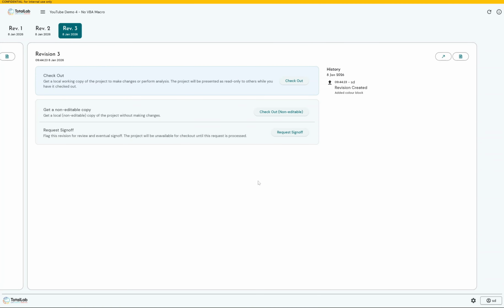Now, this use of the notes feature, you can make it optional or mandatory, but obviously there is a certain amount of responsibility on the humans if you want to use the notes section like this to fill in the gaps, to say, oh, I added data into cells A3, A4, A5. There is a certain amount of trust in the human operator at that point. People could get it wrong.